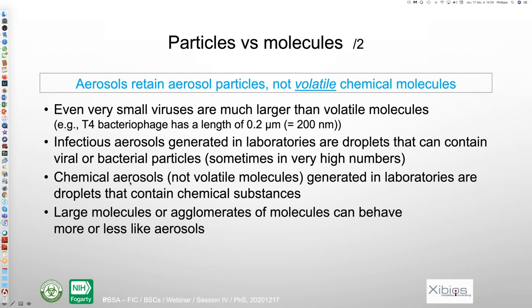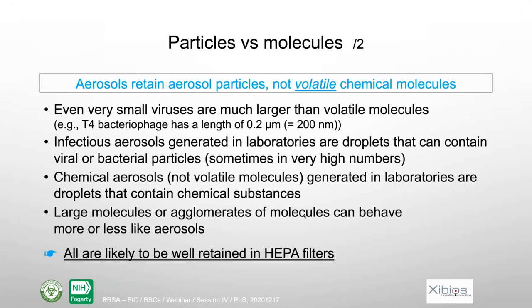Then if we handle chemicals, not just volatile molecules, but chemical liquids, and we spill liquids, for instance, or we create an aerosol, then those aerosols will also be stopped because they are not naked molecules, they are not isolated molecules. There will be a droplet, and that will be stopped by the HEPA filter. Also, one thing to know is that large molecules or agglomerates of molecules can behave more or less like aerosols. That means that all those types of materials are likely to be well retained by HEPA filters. So HEPA filters are really extremely efficient in retaining all particles and also groups of molecules, for instance.